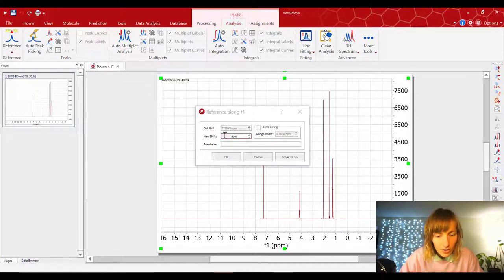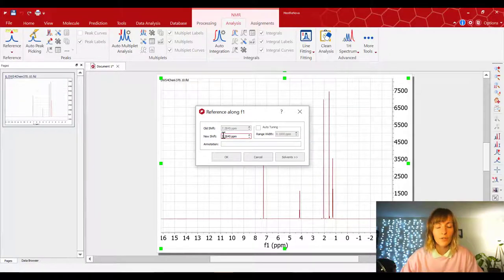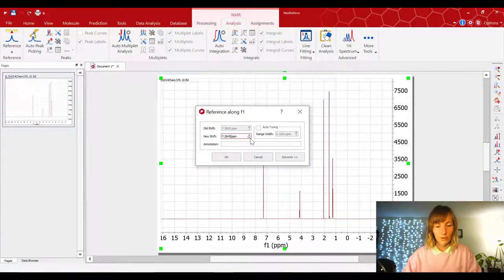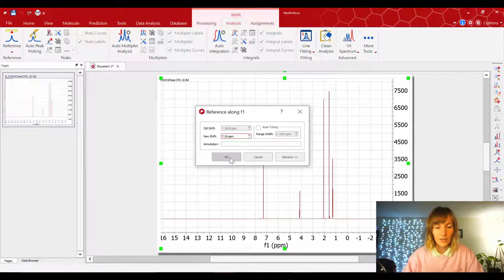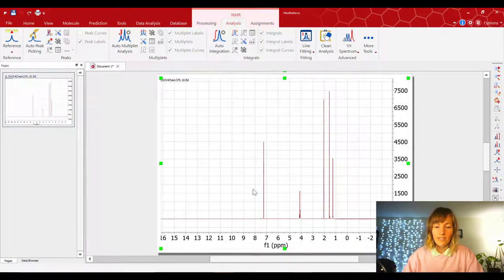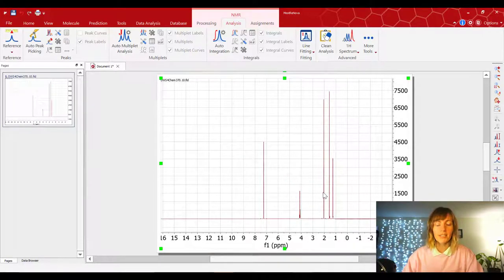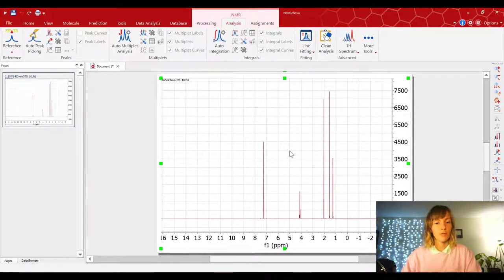And now you're gonna come over here to the new shift box, and you're gonna type in 7.26. So delete the old number, and type in 7.26. Press OK. And now our spectrum is going to be nicely calibrated to whatever it's supposed to be.